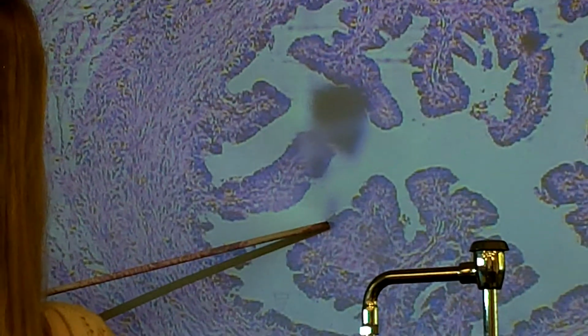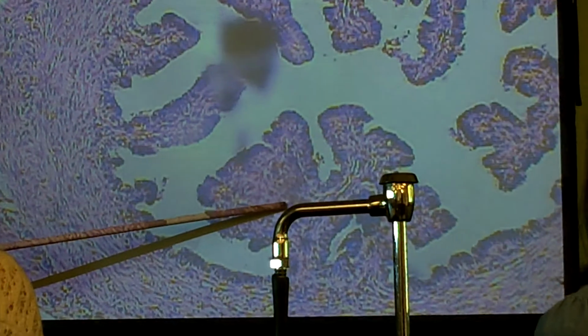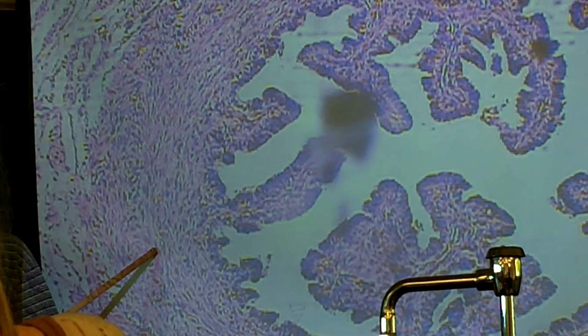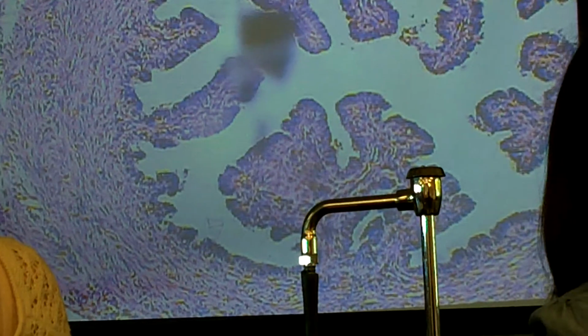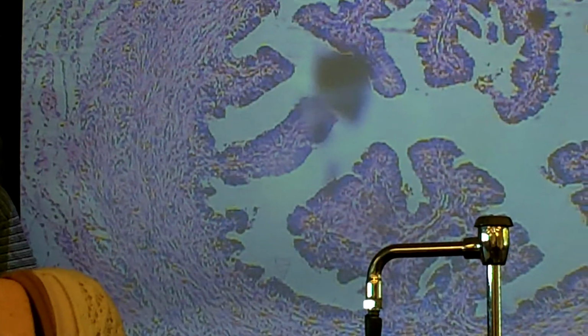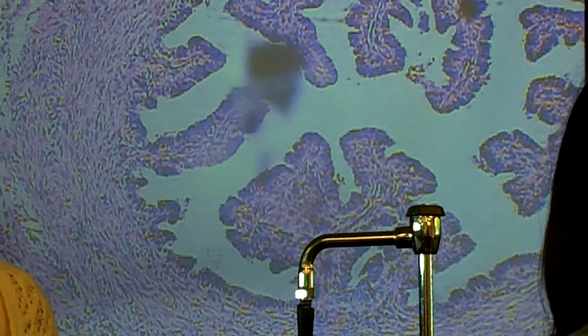So again, ciliated columnar epithelium if we ask for the tissue type, mucosal fold if we say name the specific structure, and then out here, muscular wall, muscularis, whatever you want to call it. And the whole thing is the uterine tube or fallopian tube or oviduct, whatever you prefer. All right, questions about uterine tube?